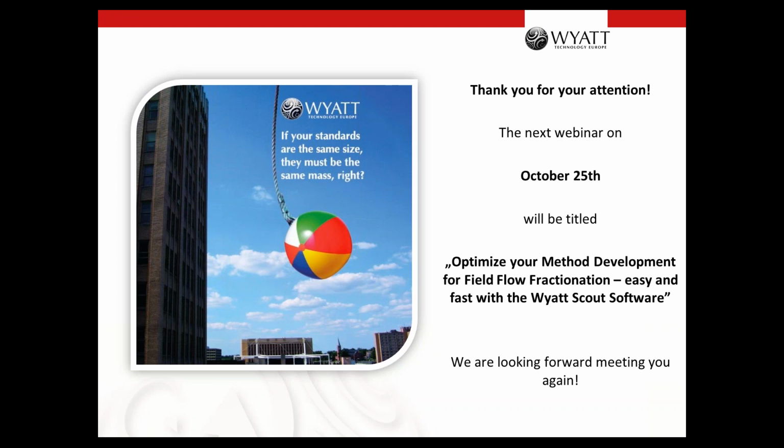And if you just want to know the amount of particles, then our light scattering software has a particle module, and this particle module can count particles if you know the refractive index of the particle. That is also patented, and you can find in the literature or on the internet how it works. So in principle, it looks at the scattering function and measures the size, and from the light scattering intensity, it then measures the amount of particles in the peak.